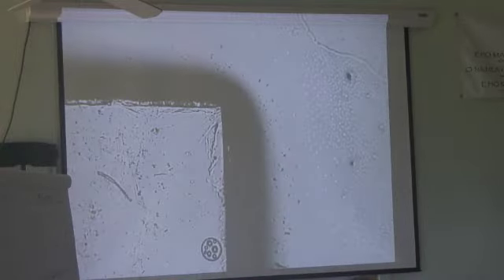Okay, another quick introduction to the microscope. So, what sample do you want to do next? Should we do just like a couple of your samples, big ones from over there? Okay. We'll go through that dilution process, kind of the best we can with the equipment that we have. Pipettes, a little bit easier to use. We're going to try to do some of this. Okay, sample. Clean line.